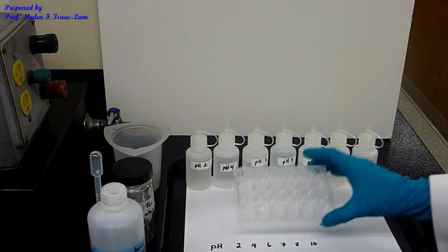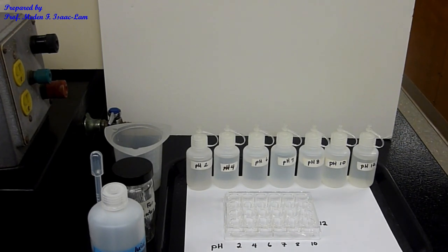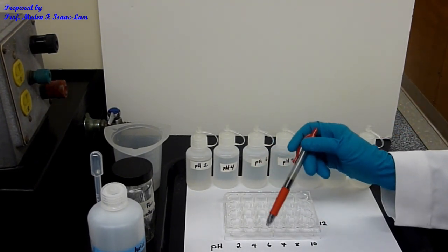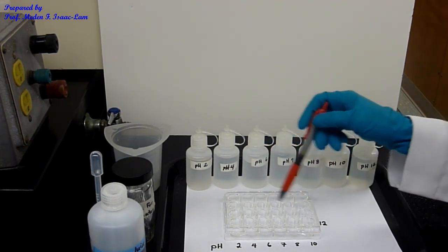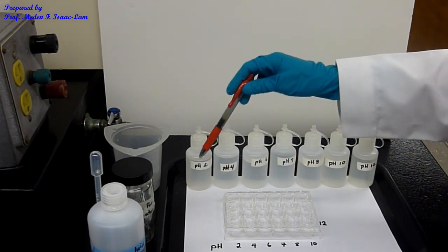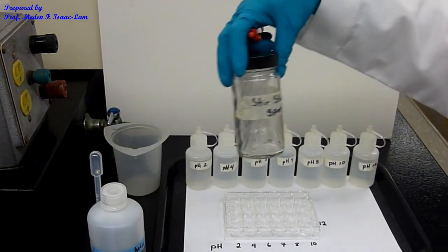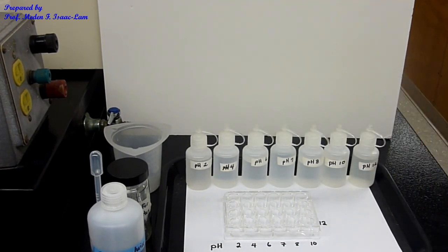This is the 24 well plate. I already labeled the paper to guide me in terms of the pH. So this would be pH 2, 4, 6, 7, 8, 10, and then 12. Again, this is a 4 by 6 well plate, and I have the solutions here: pH 2, 4, 6, 7, 8, 10, 12. And this is the cabbage juice. We also have a stir stick for the 24 well plate, and I have a waste container.